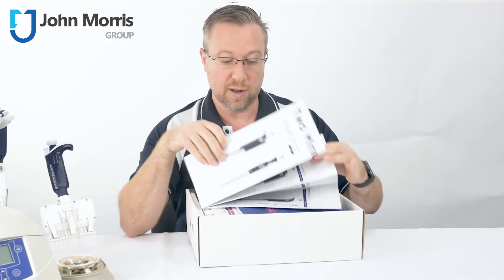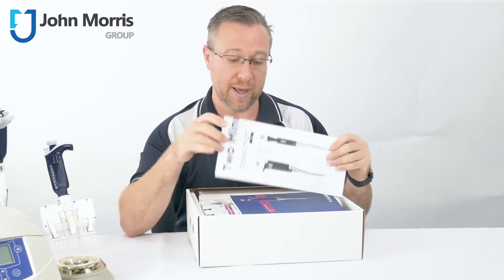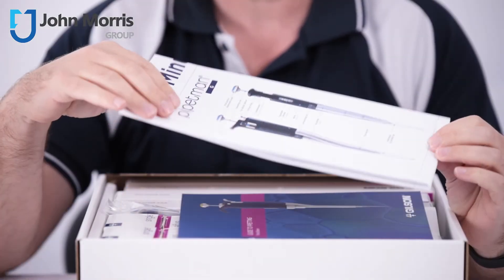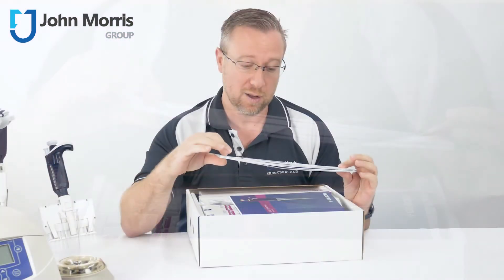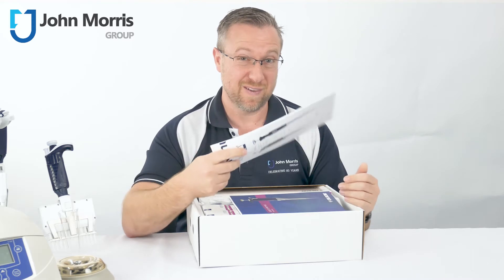The first thing you get is this handy wall chart. This is a two-minute guide for the pipette, and this helps you to identify how old your pipette is — or indeed any of the Gilson pipettes in your laboratory — and it also helps you troubleshoot any common issues you might find with a Gilson pipette. Of course, there are Gilson pipettes out there that are over 30 years of age, so this is a very handy tool.